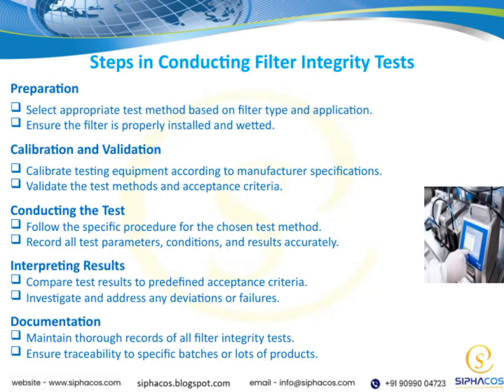Let's begin by discussing preparation. It's crucial to select the appropriate test method based on the specific filter type and its application. Choosing the right method ensures accurate and relevant results. Additionally, make sure the filter is properly installed and wetted before testing, as this can significantly impact the test outcome.